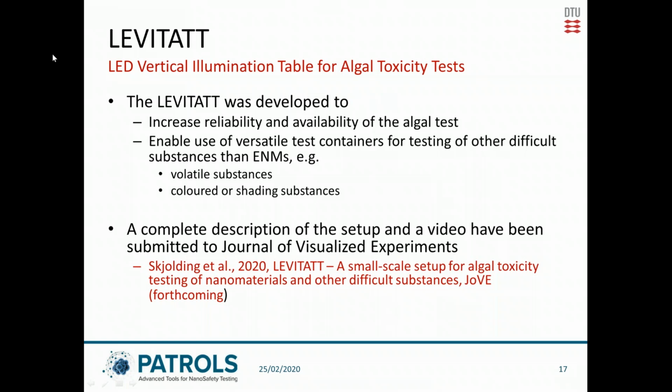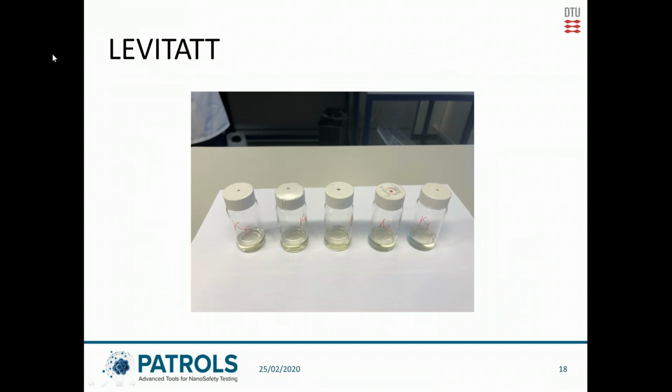We have a complete description of the setup and a video of how we are performing the experiments that have been submitted to the Journal of Visualized Experiments. The reference is seen below. The initial point of departure could be the test volume, as Anders also mentioned. It's very important to have a sufficient test volume, especially when you're testing nanomaterials, to be able to characterize and quantify the behavior of nanoparticles during your test setup.